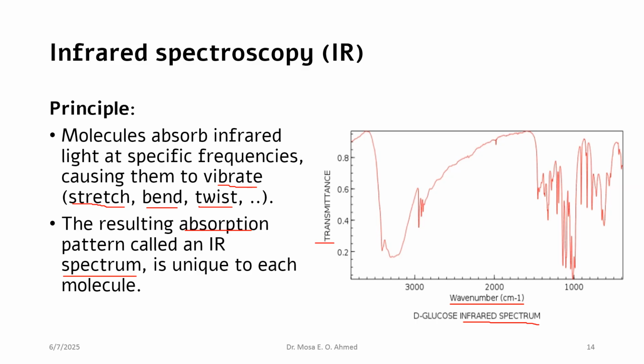The IR detector can measure the change in the intensity of IR wavelengths.